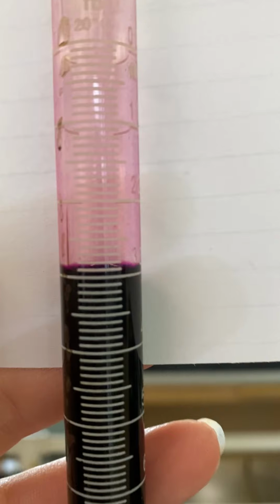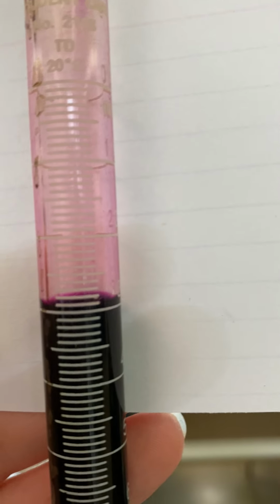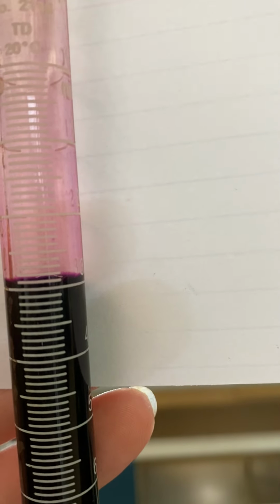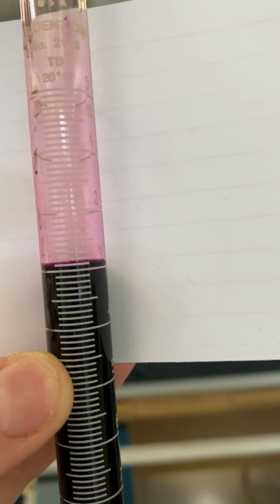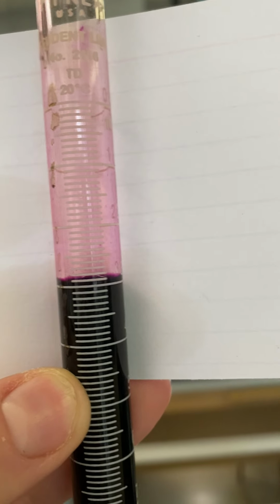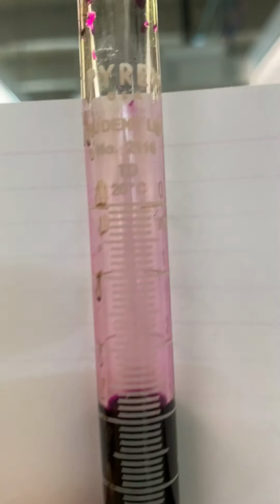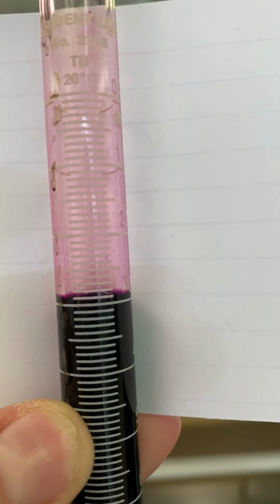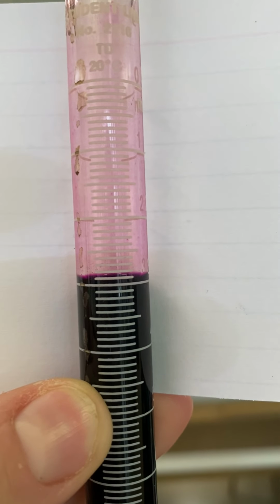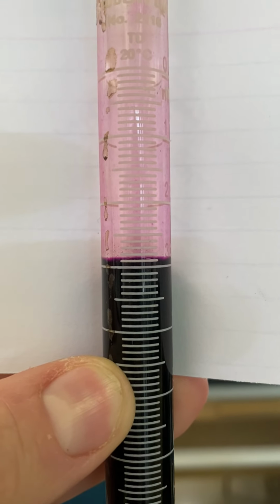What I know you can see for sure is that the purple permanganate is between 2 and 3 milliliters. Okay, the line of the purple permanganate is definitely above the 3, right? So it's definitely less than 3 milliliters. It's definitely more than 2. Okay. I think right now would be a good point to pause the video and see if you can read the same thing as me.